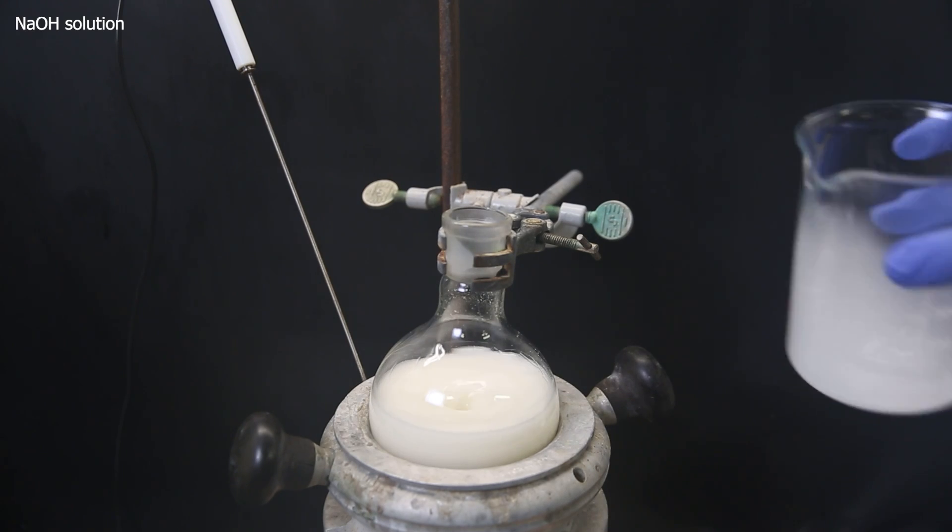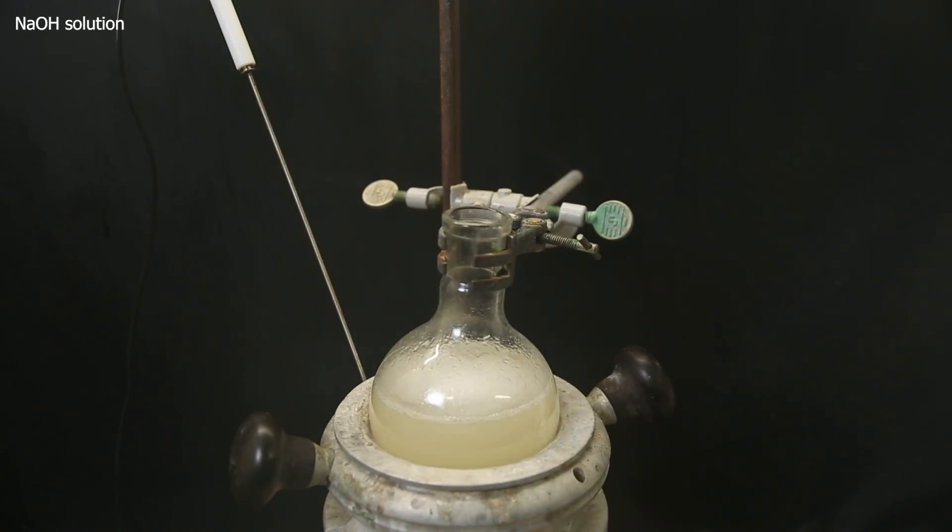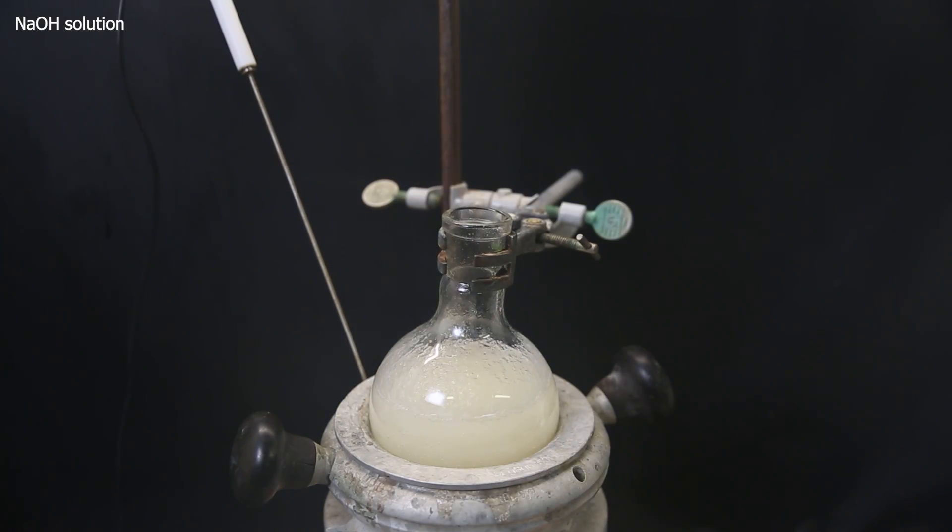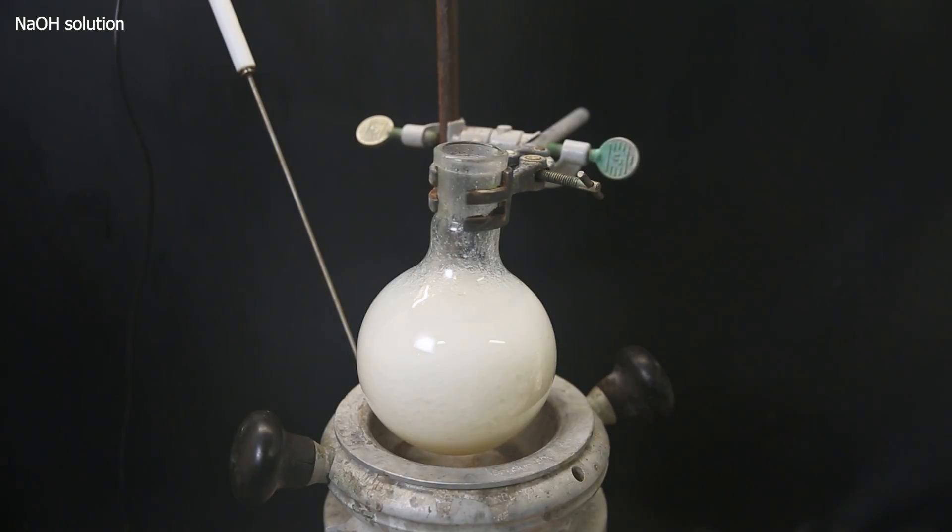I add this solution gradually to the mixture to destroy all the acid. It first turns yellow and then becomes cloudy again. I keep adding more sodium hydroxide solution until there is no more exotherm upon addition, signaling that all the acid is gone.